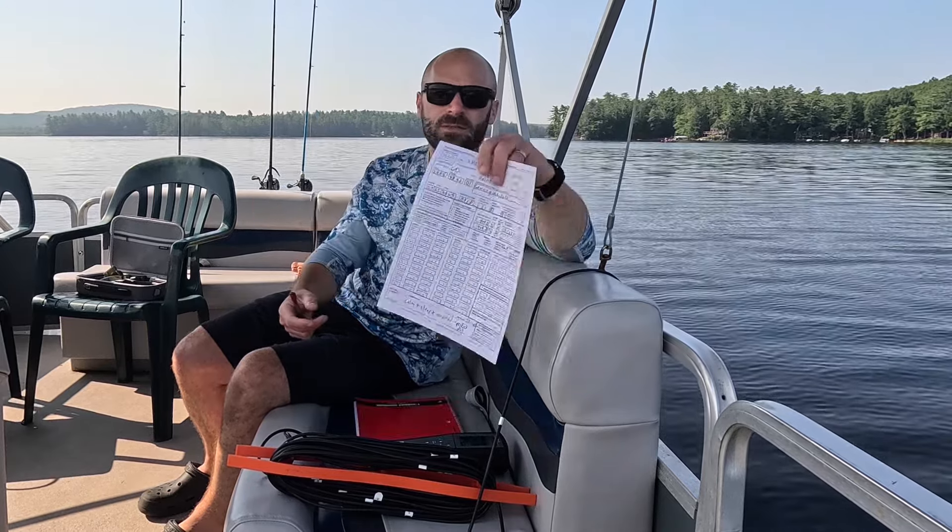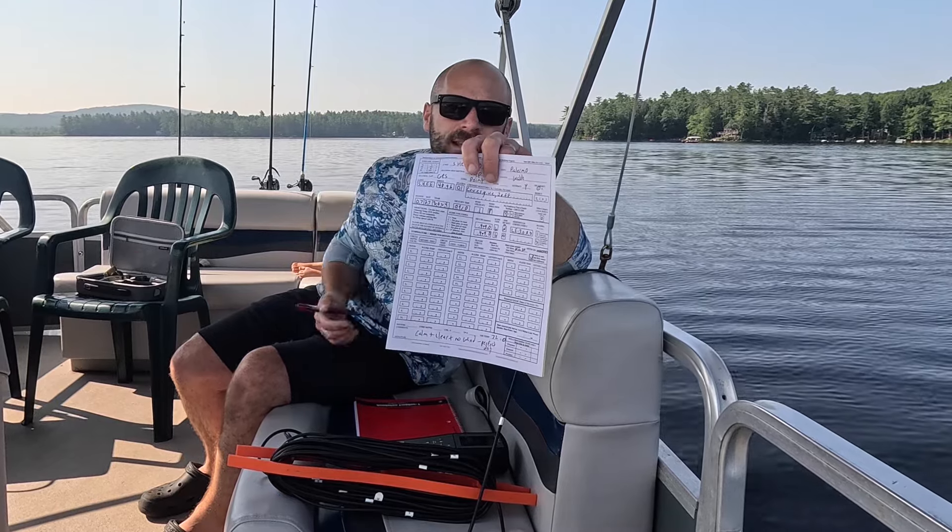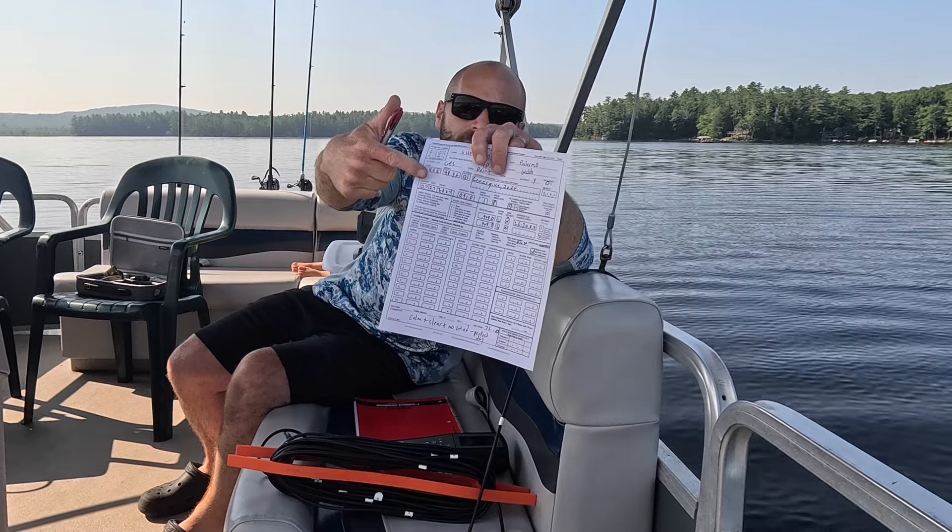The next test is the dissolved oxygen test. We use this YSI Pro 20 meter — it measures temperature in Celsius and oxygen in milligrams per liter. A healthy lake is between 6.5 and 8. In Sheepscot, we are super deep, so we have to go down 140 feet, whereas other towns only have to test their ponds to 30 feet. This part is time-consuming. We go one meter at a time for the first 15 meters, then five at a time. We already put our clarity reading with the Secchi disc, our geographical and weather information, and then my information — because this will later be submitted to the state for the Lake Stewards of Maine to use in their analysis of the health of Maine water.